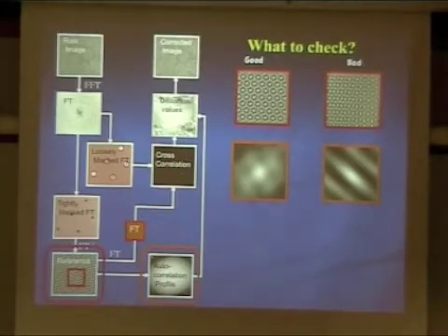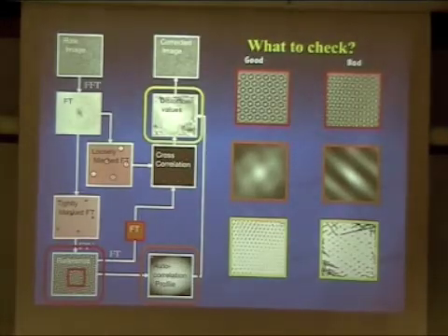So a lot of the time it will cause a situation like this. This one happens because I have a correlation profile that looks like that. In a certain direction, it's basically doing a random walk. It picks whatever it can find. Because when we are making our references, it's not just one point.